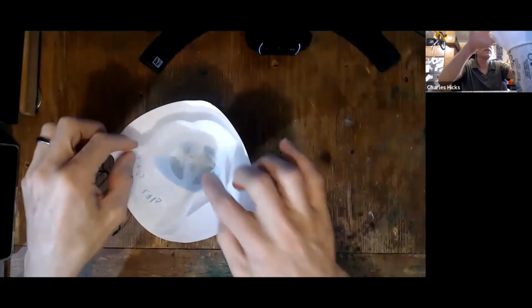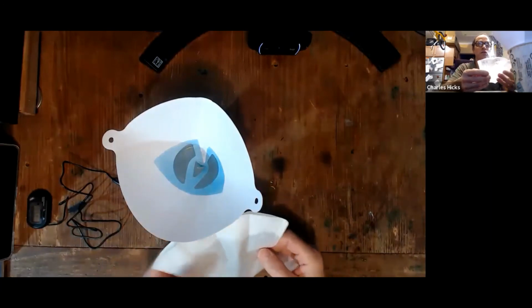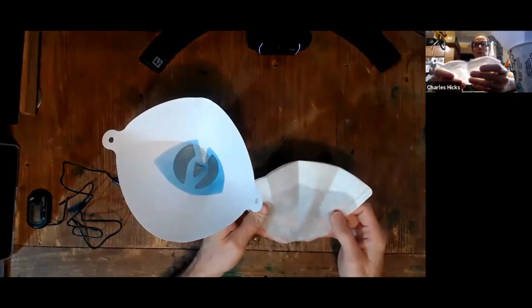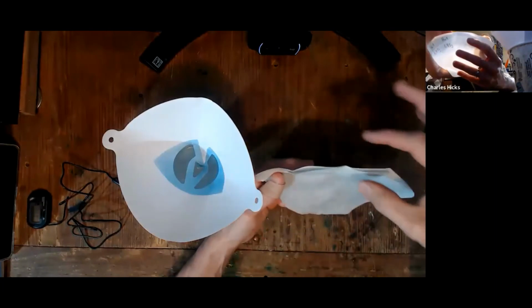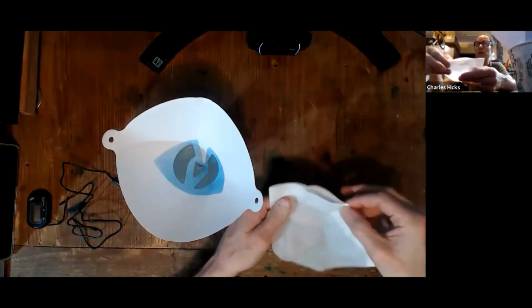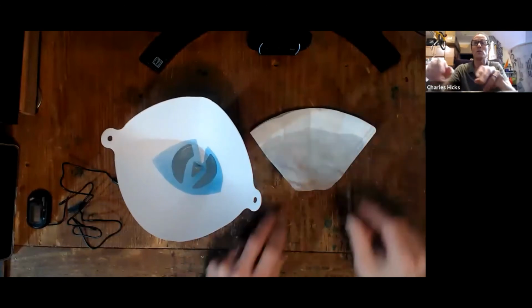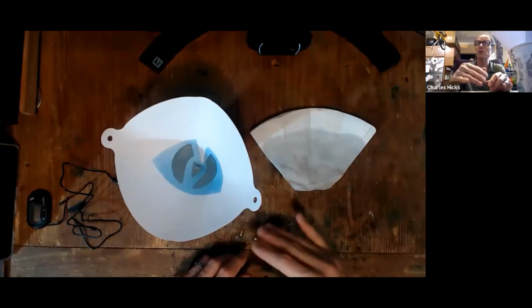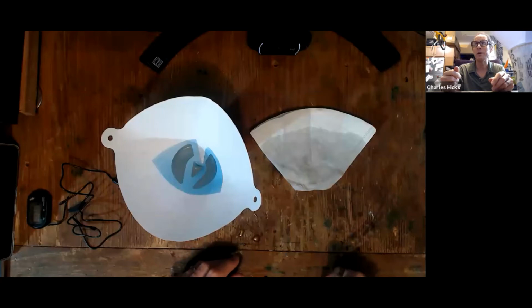So after the solution has drained through, you want to take this filter, and this filter needs to be stored somewhere where it can safely dry. As we've done in other experiments, we need to dry it out without losing any of the solid that's in there. So you could hang it up. You could use one of the binder clips. We gave you 3 of them in your kit. You could hang this up like on a clothesline, or if necessary, you could just leave it laying out in your work area. And if you do that, every day or so, turn it over. If you could also lay it in a place that's warm, like if you can hang it near a radiator or something like that, that would be good. And after a week, we're going to reweigh this filter.